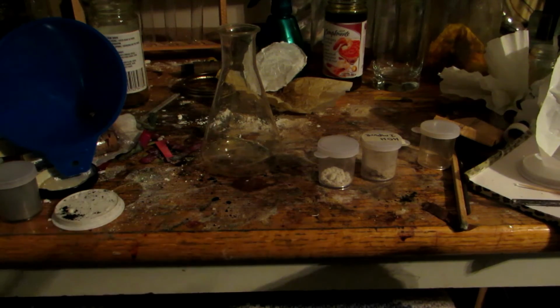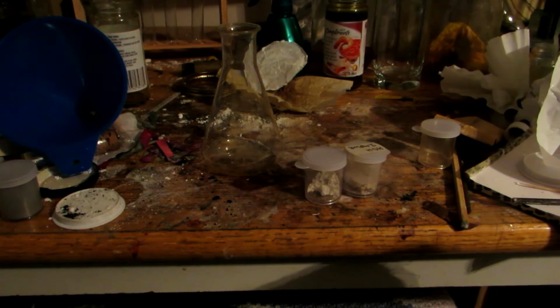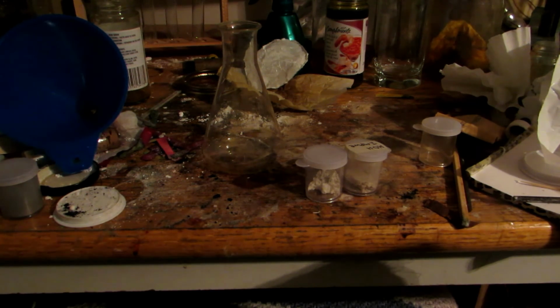Okay, so this is quickly for both methods to produce potassium hydroxide I've showed. You can see we have the potassium hydroxide from each method. And I'm just doing it at the same time because I want to save ethanol. So in a previous video we actually distilled some nice 95% pure ethanol, and we're going to be using this because potassium hydroxide is quite soluble in ethanol. However, potassium carbonate is essentially insoluble in ethanol, so that leaves us an excellent method to separate them, because our potassium carbonate can simply be filtered off, and our potassium hydroxide will be in solution and can be boiled down to obtain the pure potassium hydroxide.